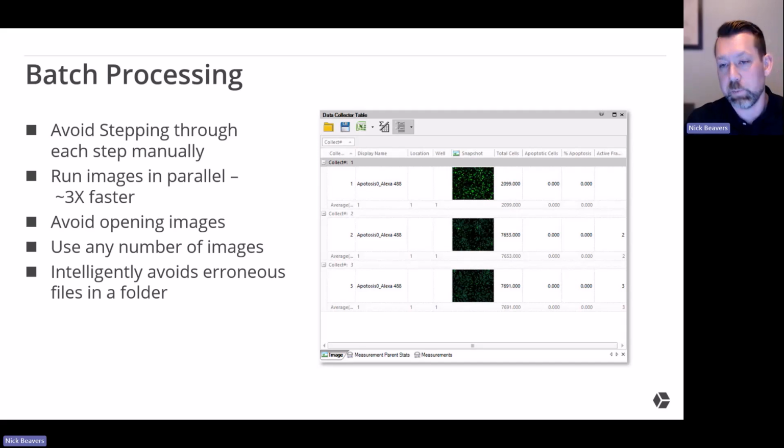Not only that, one thing that ImagePro does, and would be available to really any software, would be parallel processing and really spreading out the load across your GPU, across multiple cores of your CPU, where what you could do is not open the image. Opening the image is actually a resource-intensive operation. Opening panels and running operations and showing overlays. You can get rid of all that. Everything can just be done very transparently, and it saves the processor, the GPU, a lot of time.